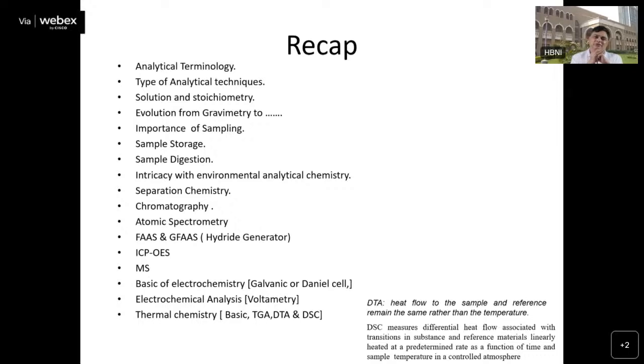Then there is ionization interference, because certain elements like alkali metals give up electrons very easily in the flame. So we have seen how we use an ionization suppressor, like potassium chloride solution, in both the standards as well as the samples. That's how we avoid ionization interferences.